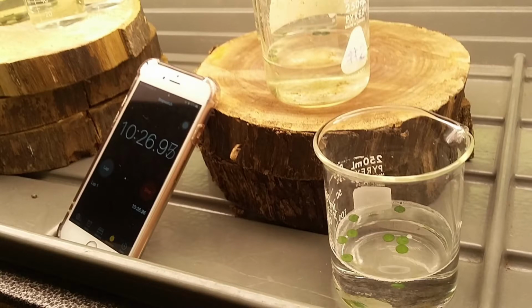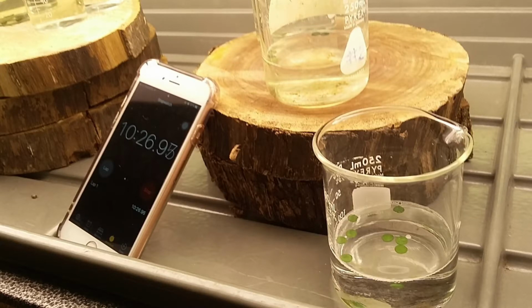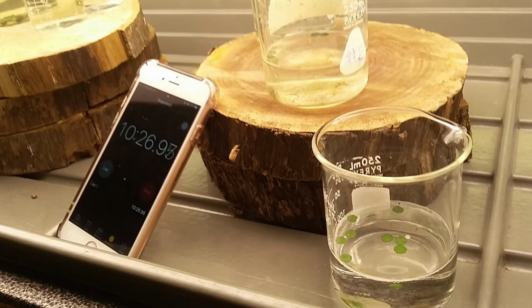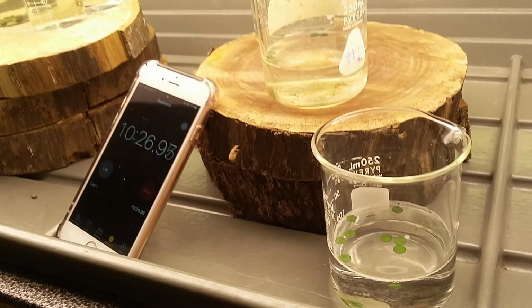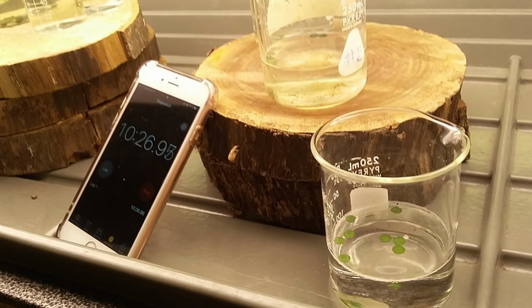Therefore, the leaf disc in the controlled beaker would have received more light and therefore would have created more oxygen, allowing for the leaf disc to float significantly faster than those in the 0.2% solution beaker, which explains why the results show a slower rate of photosynthesis in the beaker with the 0.2% sodium bicarbonate solution, because before a plant reaches its light saturation point, a higher concentration of CO2 will not increase the rate of photosynthesis in that plant. CO2 is only a factor during light-independent reactions with regards to enzyme concentrations in the Calvin cycle.